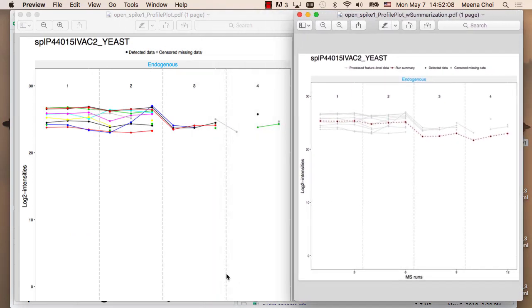If anybody can remember, we had this line and a huge slope with lower values, and for Skyline we could see some outliers here, and it was very noisy. And then this is the same protein from OpenMS, where you can see around 10 features. However, it's going down, and from this point it is completely missing, right? So internally they apply some threshold, and then there's no value.